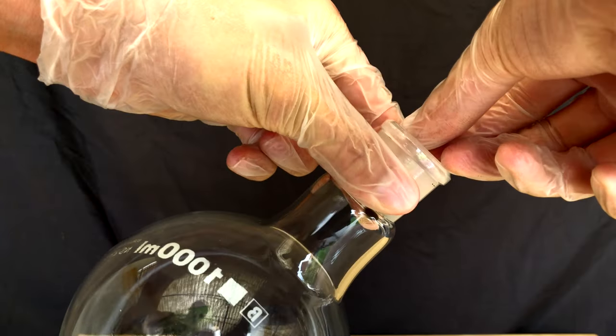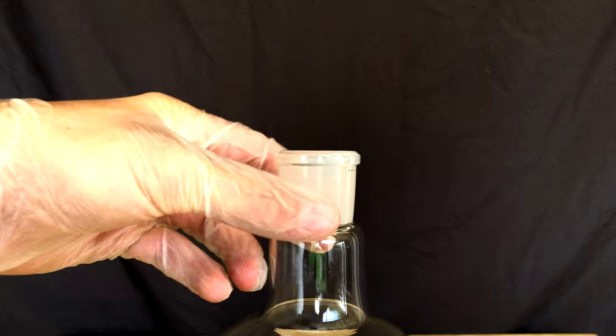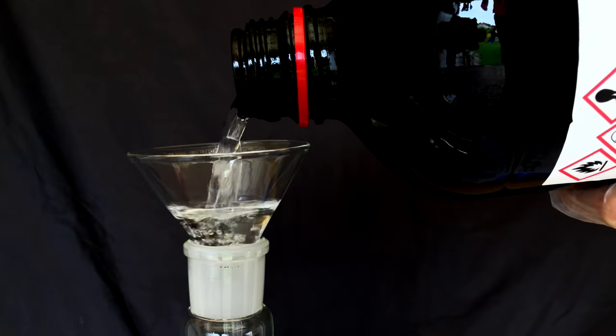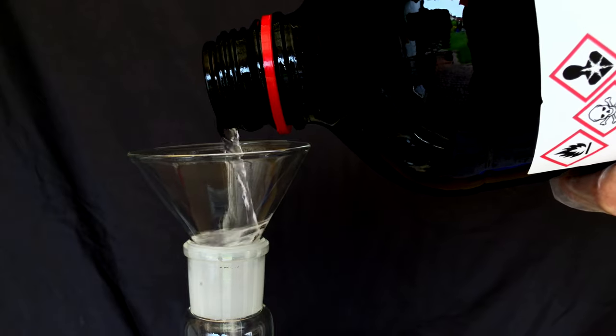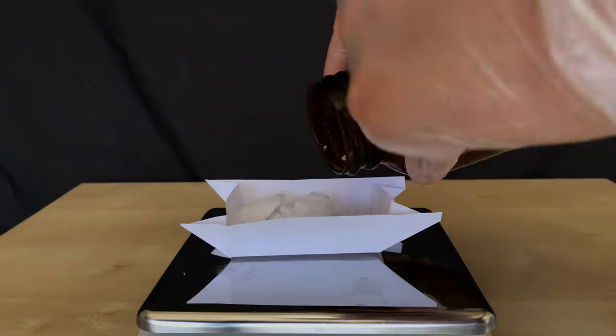To start off, a stir fish was dropped into a large round bottom flask. About 300ml of methanol were then measured out. It's important to work fast and to work in a very well ventilated area while dealing with methanol because it is toxic.